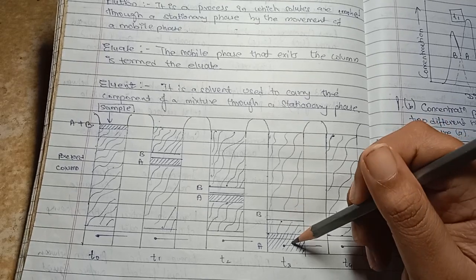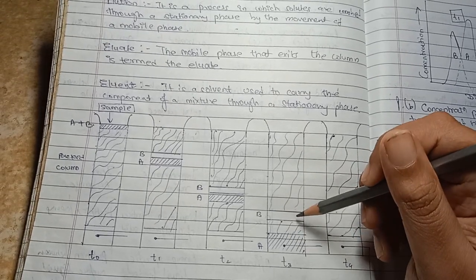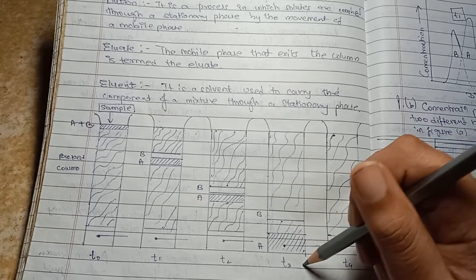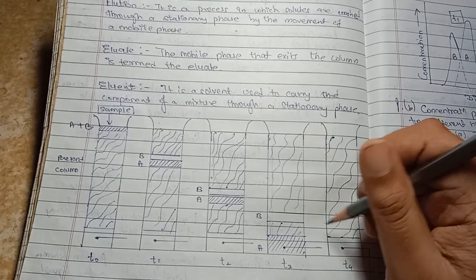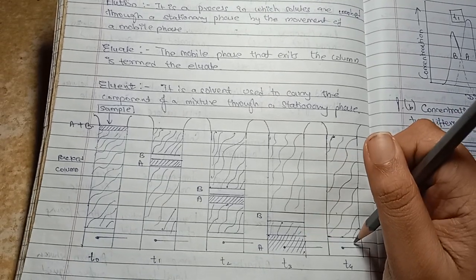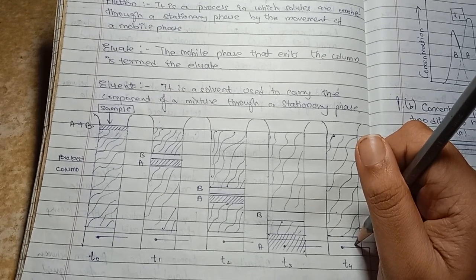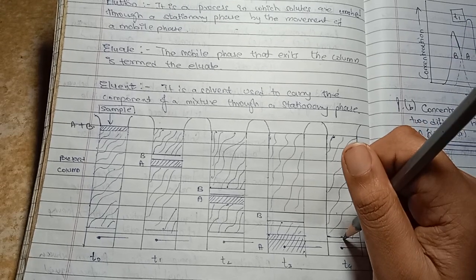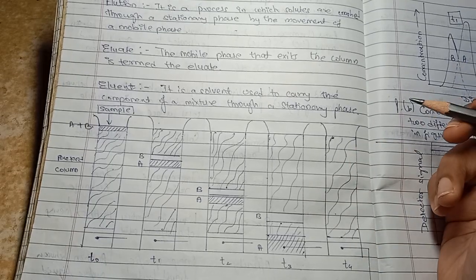That means the components of the mixture are successfully separated. The first component to come out of the column will be component A. Then once component A has completely moved out of the column, after some time at T4, component B will also move out of the column.